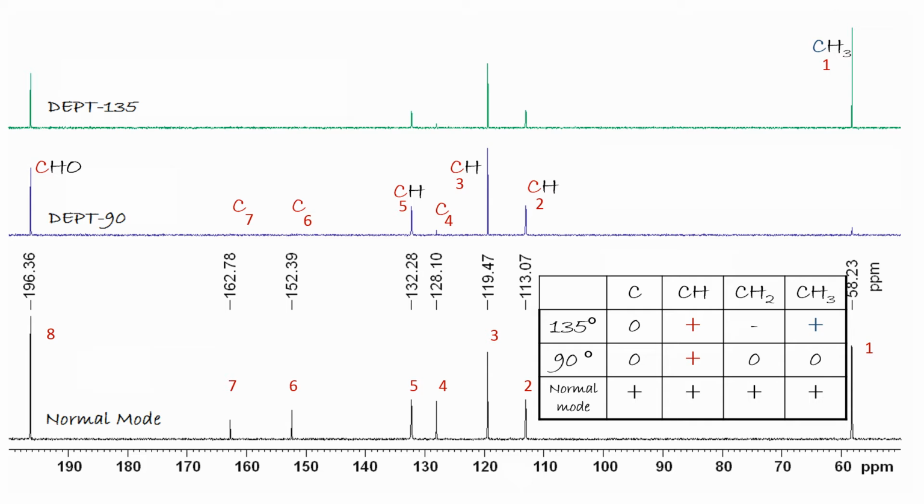The carbon-13 normal mode gives us 8 signals, which means that there is no symmetry in this molecule. We have C8 and we have 8 signals for carbon decoupled. So that's what we have here.